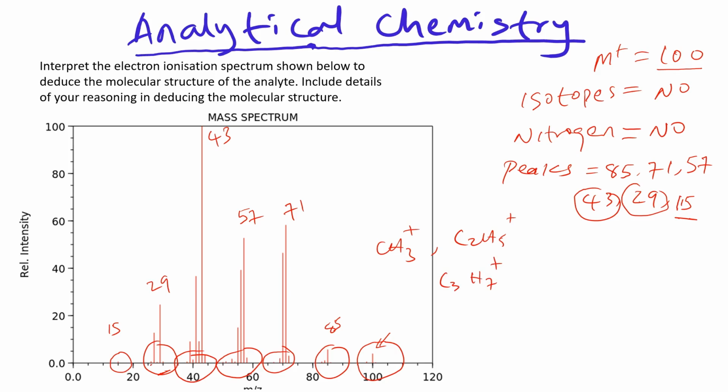So basically this compound, this analyte, is an alkane.